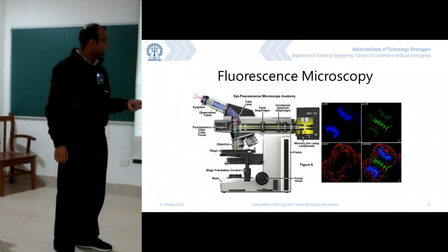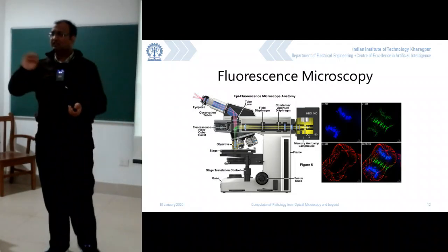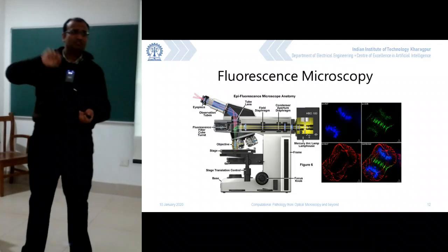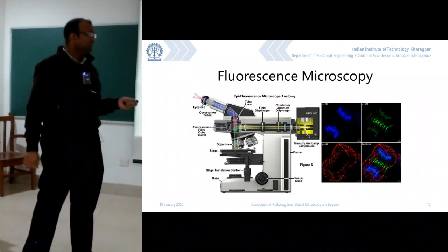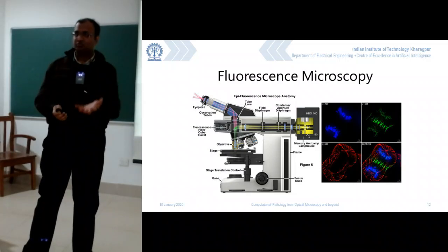So these are about some mitochondrial structures, if I remember it clearly, and you have these strands in the green fluorescent protein, the blue fluorescent protein, and the red fluorescence levels which are seen over here. Those details are what we had covered yesterday, and we had shown you exactly how it works.